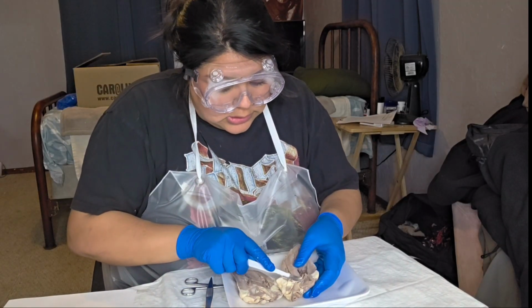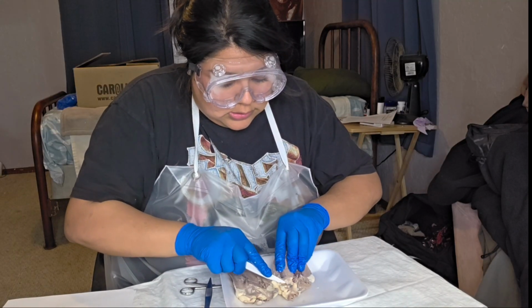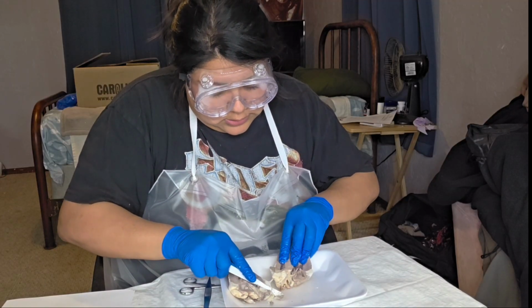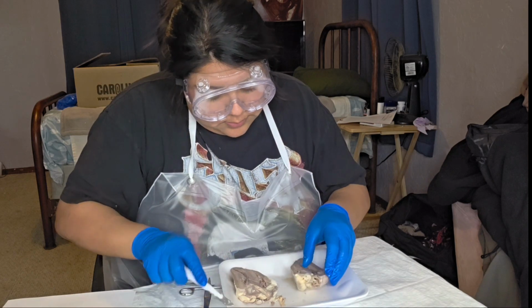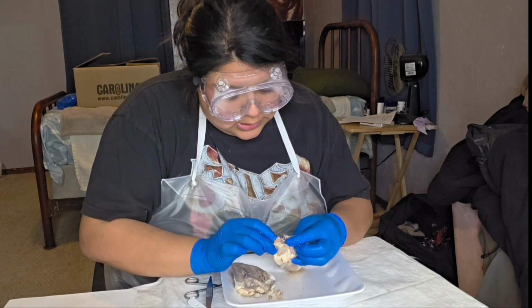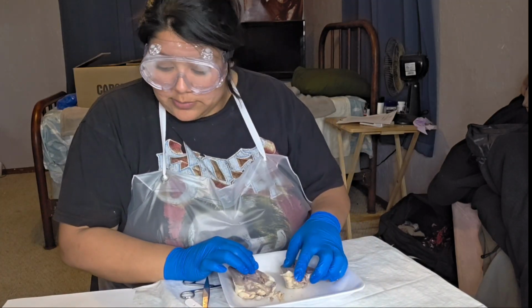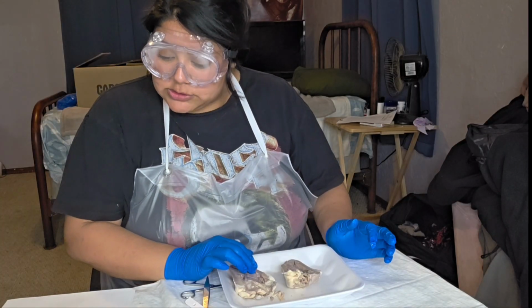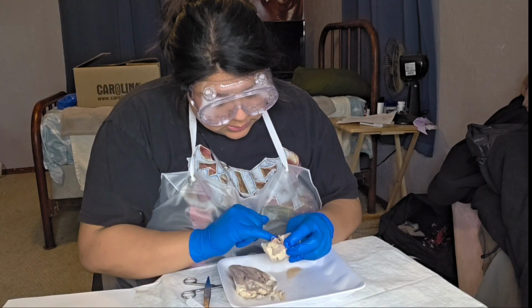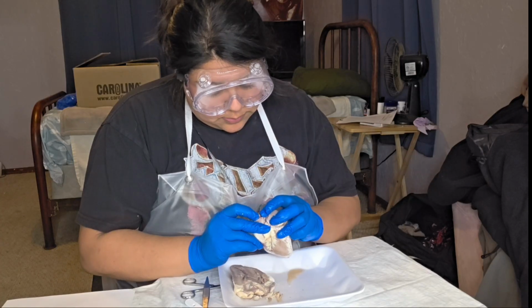Okay, so we are going to make a cut here so we can see inside that valve. So we can see up top over here, see these valves. For the aorta, we count the three leaflets at the top leading from the left ventricle to the aorta, and make note of their half moon shapes, which are down here and right here.